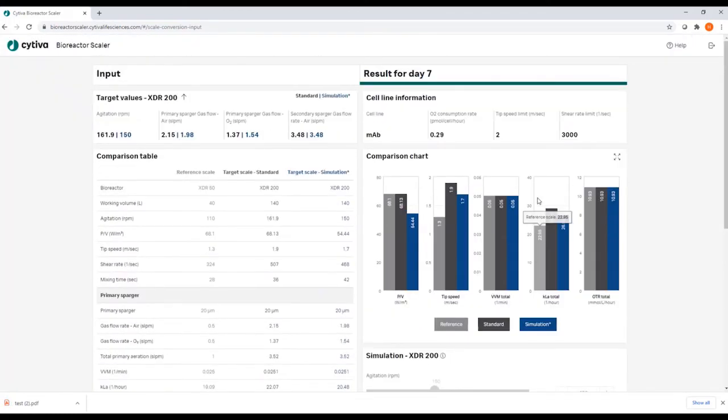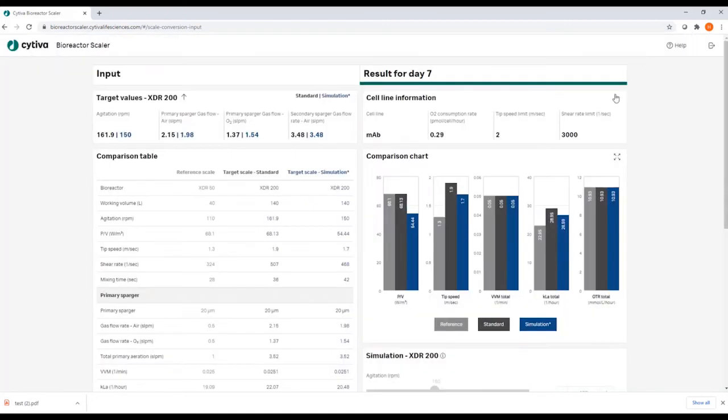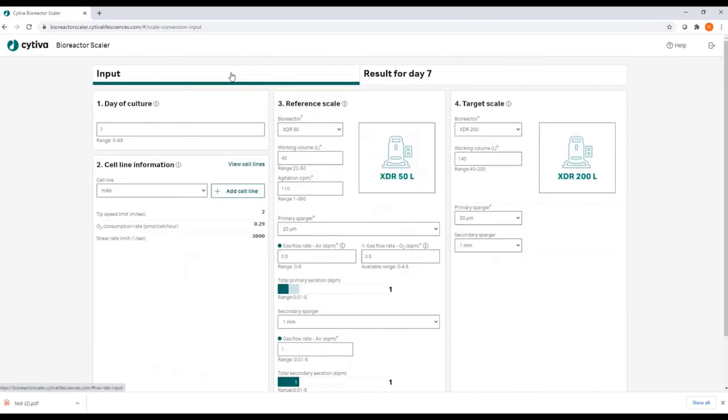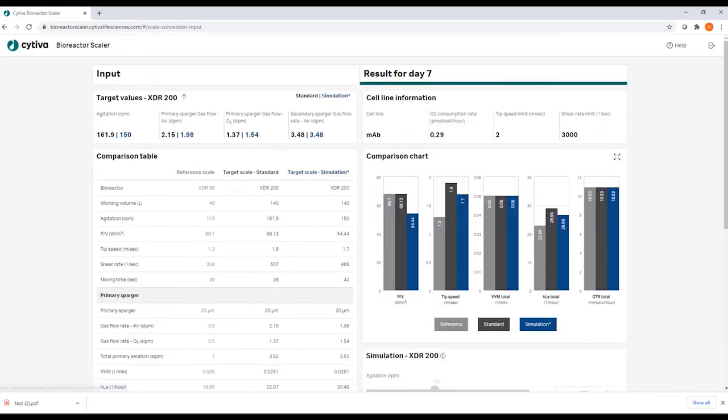You can also enlarge the comparison chart to have a better overview, and you can move back into the input tab to manipulate your input values and start a new calculation, basically flipping between the input and the result screen.